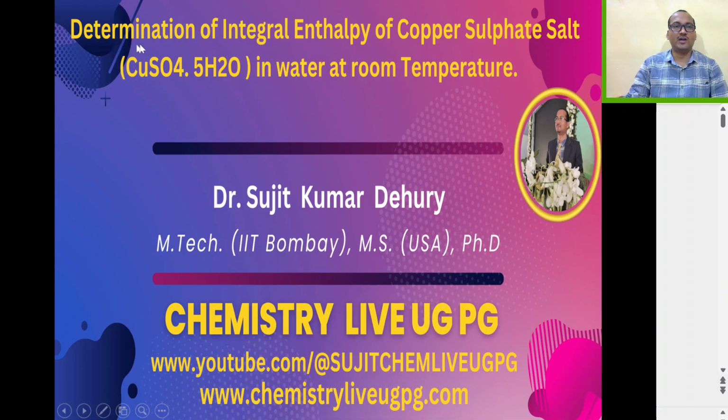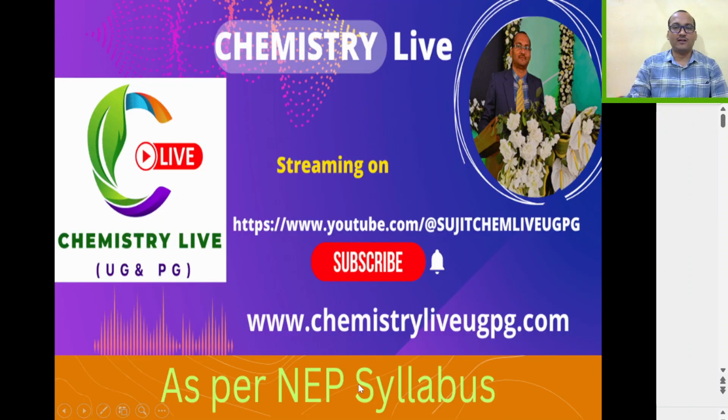Today we are going to talk about determination of integral enthalpy of copper sulfate salt in water at room temperature. So this is in accordance with NEP syllabus.